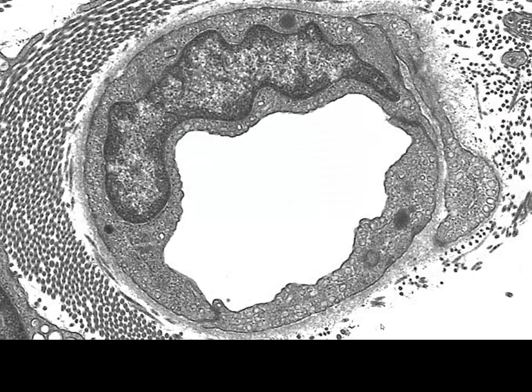And then here we have our continuous capillary. We can see our endothelial cell, one endothelial cell thick, possibly pericyte cytoplasm here. And then we have our occludens type junctions, fascia occludens, here between these processes.